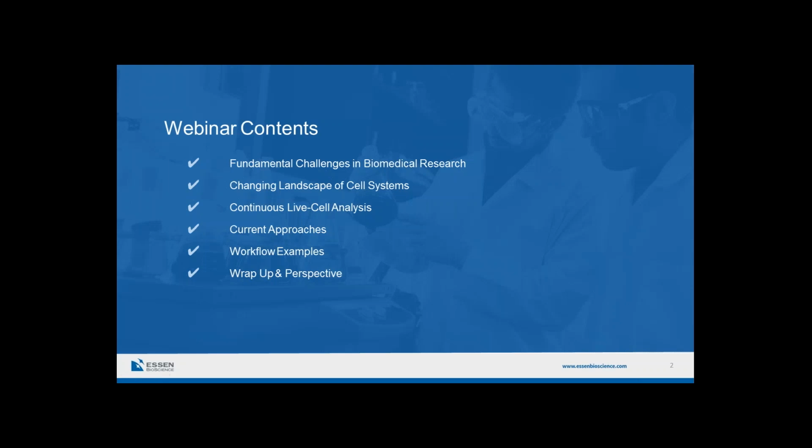So, the structure of the webinar is as follows. To begin with, I will overview some of the fundamental challenges that we face in biomedical research, and then discuss the changing landscape of cell models and cell systems that we use. I'll then go on to introduce continuous live cell analysis as a concept and as a method, and then describe some of the current and emerging technologies which are bringing this method to the everyday researcher. I'll then spend some time illustrating the application of continuous live cell analysis in some worked examples before wrapping up and providing a perspective on the future.